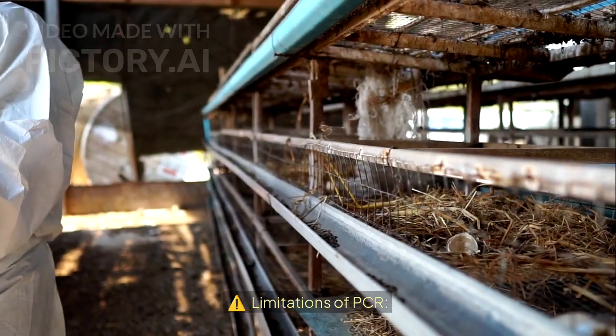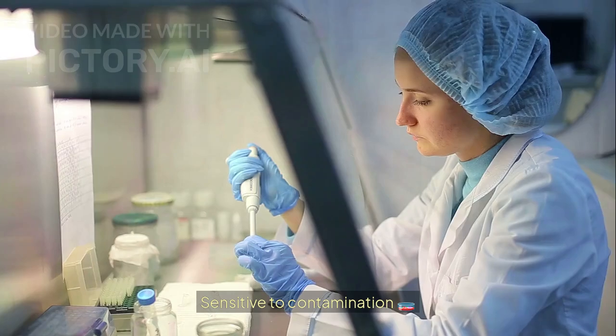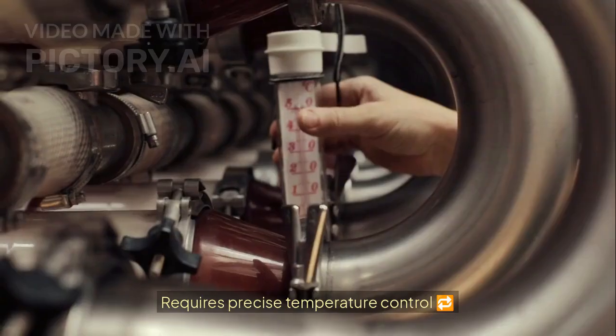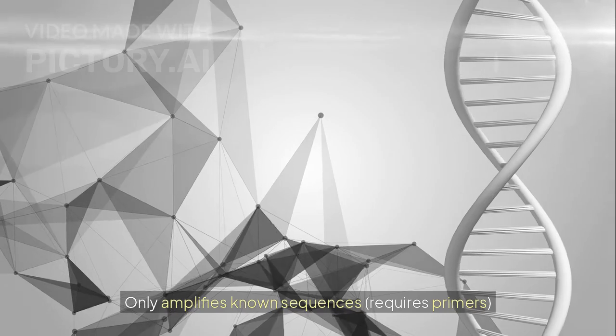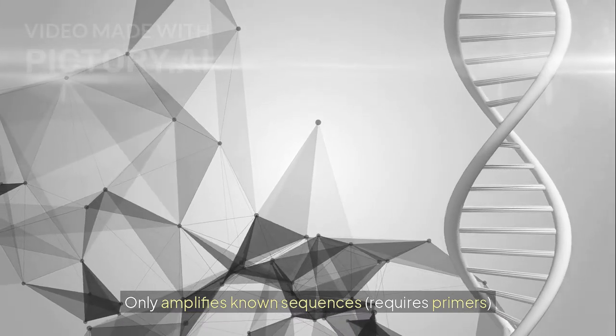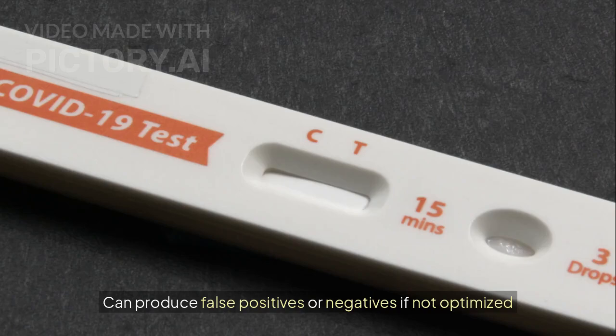Limitations of PCR. Sensitive to contamination. Requires precise temperature control. Only amplifies known sequences. Requires primers. Can produce false positives or negatives if not optimized.